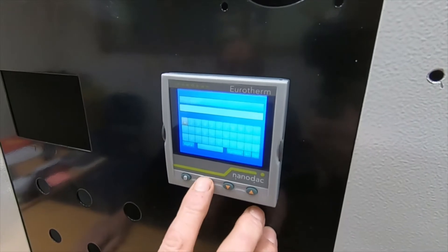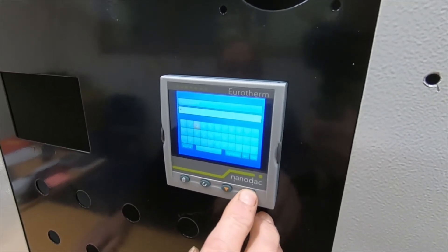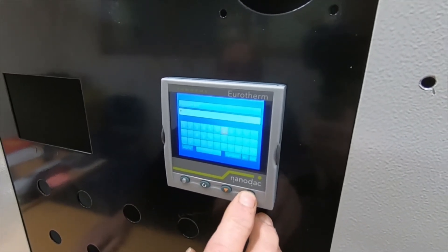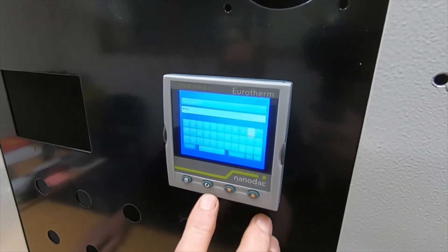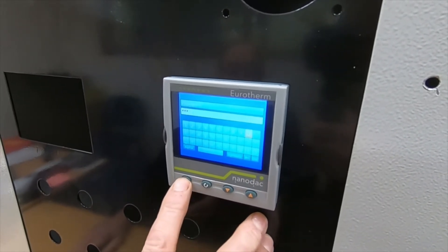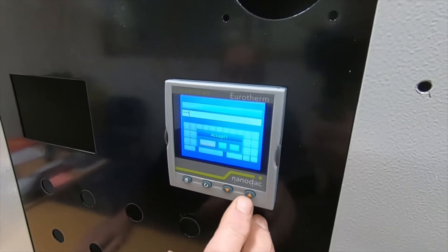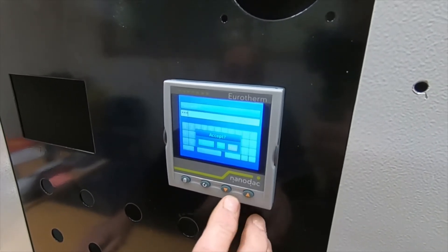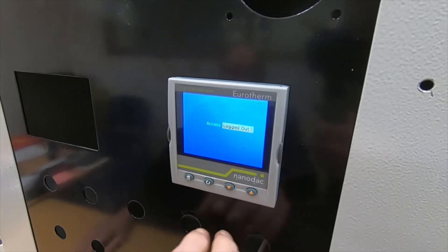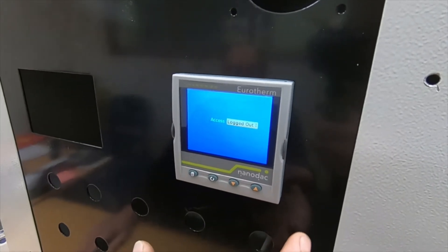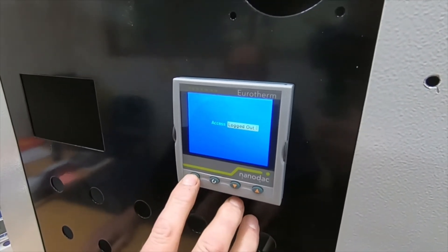Numeric: 1, 0, 0. To accept that, press the page button again, use your cursors, select yes, and press the scroll button. That didn't work because it's a later instrument, so go again.